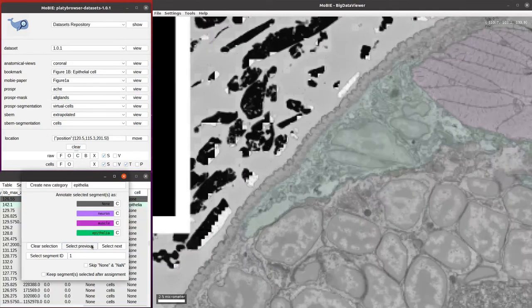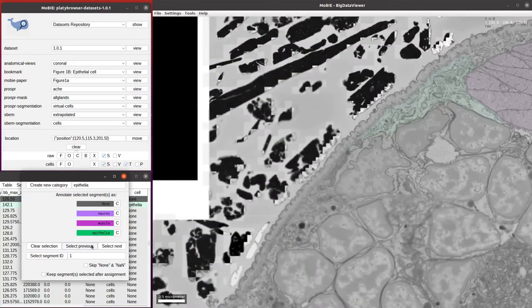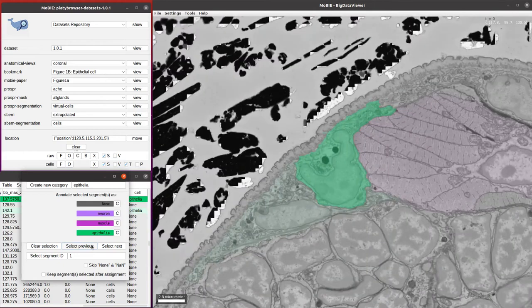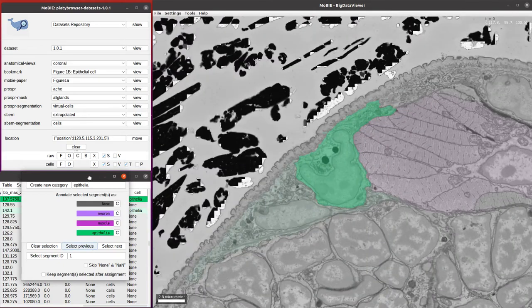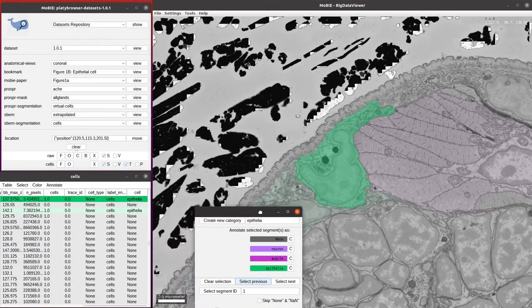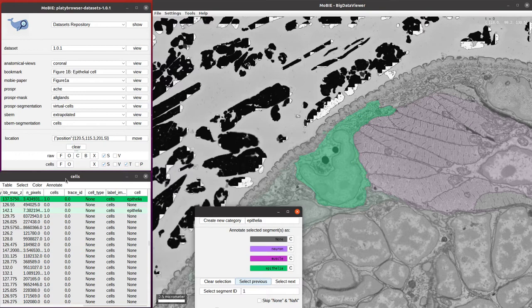You can also use the select previous button to go back to our previously selected cell. In this way, we can really methodically go through and assign cells to different groups.